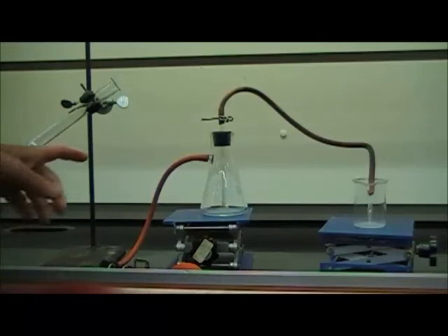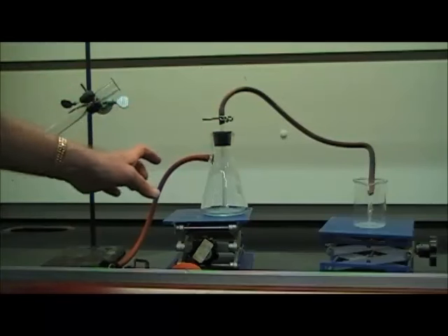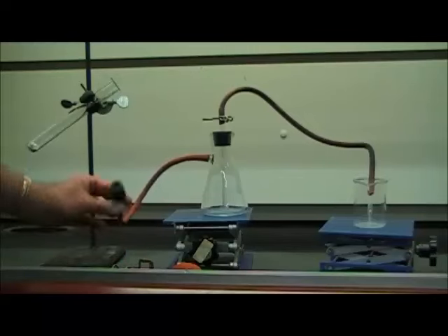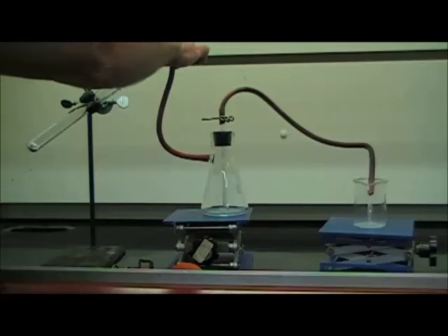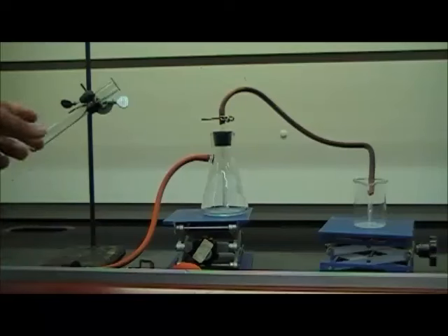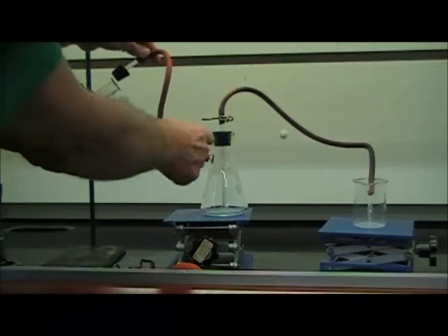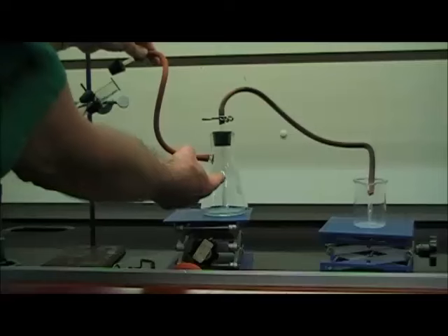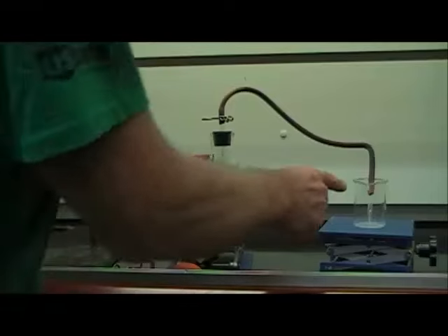We start with a sidearm Erlenmeyer flask, or sometimes called a filter flask, with a piece of glass tubing going through a rubber stopper, which will fit into the neck of a large test tube. And in that test tube we have some potassium chlorate and a little bit of manganese dioxide. When that mixture gets heated by the Bunsen burner, it will produce oxygen gas. The oxygen gas will be forced through this tube into this container. There will be some water in this container. That water will be forced up through this tube and over into the beaker. We'll then measure how much water came over.